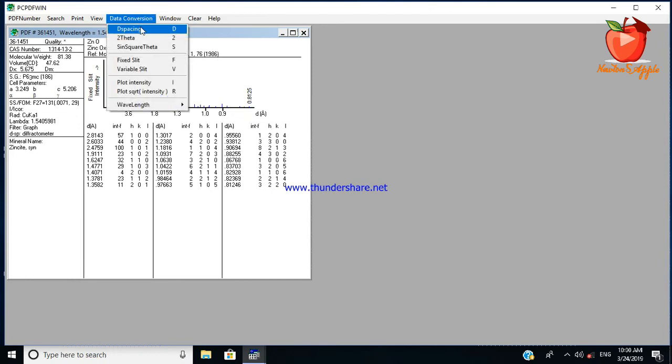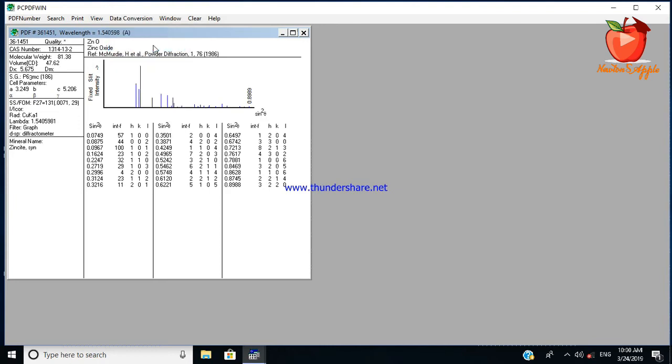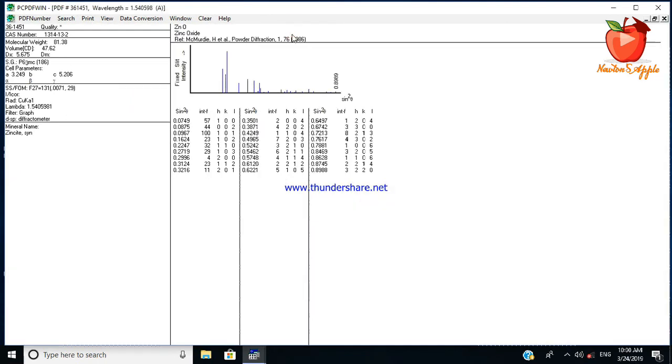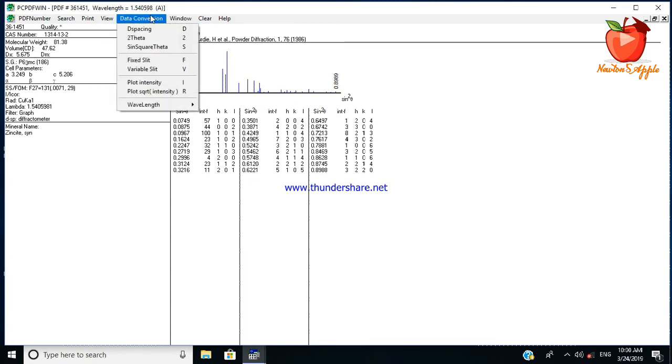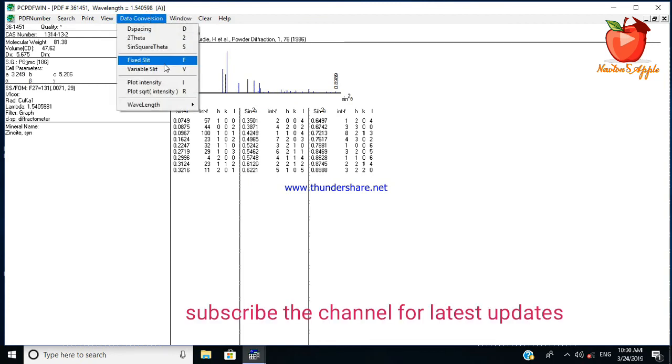You can see the two theta sine square theta value also. As per your need, you can select two theta or d spacing or the sine square theta values. You can also see the fixed slit, variable slit, point intensity values.